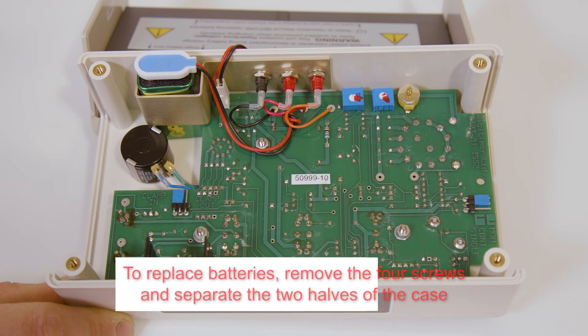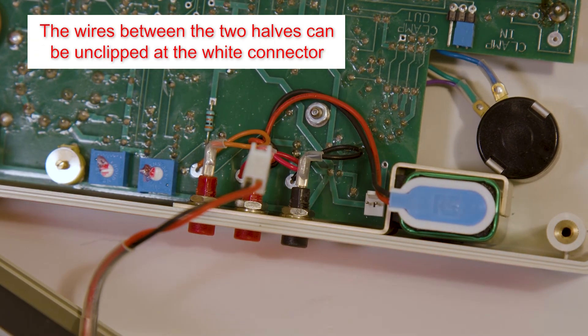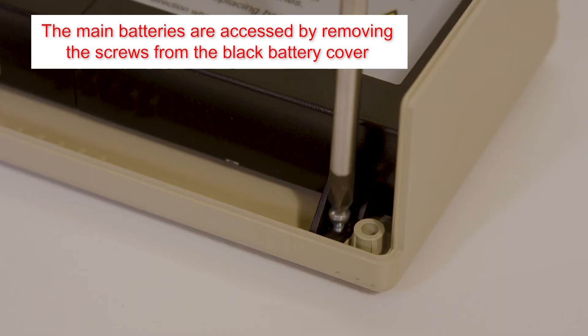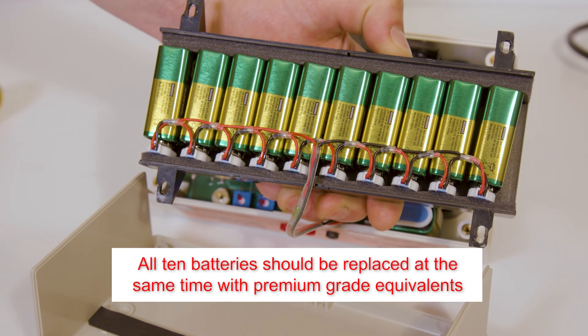If batteries need replacing, remove the four case screws and slide the two halves of the case apart, taking care not to strain the red and black wires that connect the battery pack to the main circuit board. If necessary, these wires can be disconnected from the main circuit board via the small white clip. As well as the main battery compartment inside the black housing, the single control battery resides in the other half of the case. The main battery compartment is opened by removing the four screws at the corners of the housing, which can then be lifted away to reveal the batteries. All batteries should be replaced at the same time and with a high quality alkaline equivalent. Once batteries are replaced, the case should be reassembled in reverse, taking care to reconnect any wires.